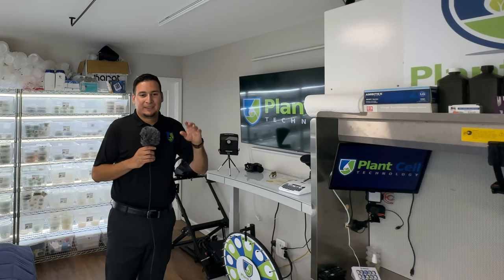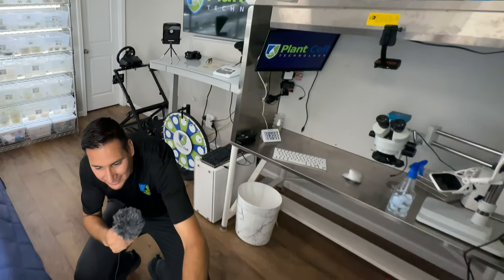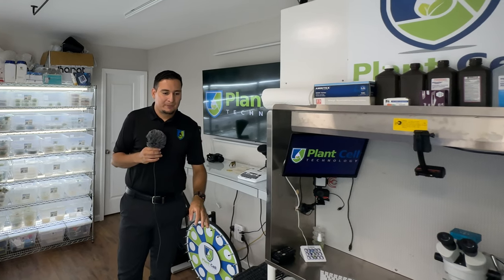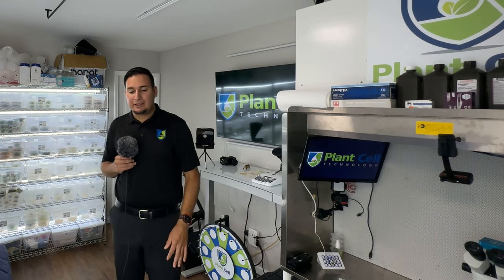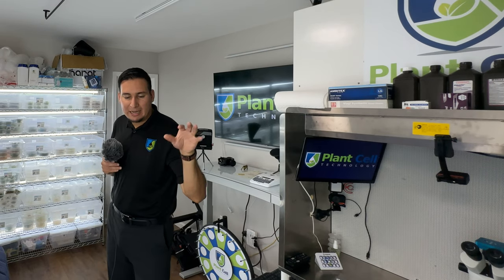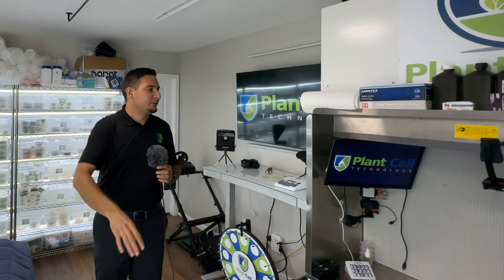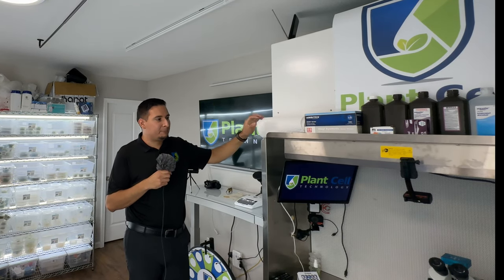The tripod right now is on a mini fridge. There is a mini fridge right here where I keep all my tissue culture media, all the chemicals, and the plant regulators. I do not keep any food in there — that's just my lab fridge. I have a separate fridge in my kitchen for everything else, but no food allowed in this fridge.